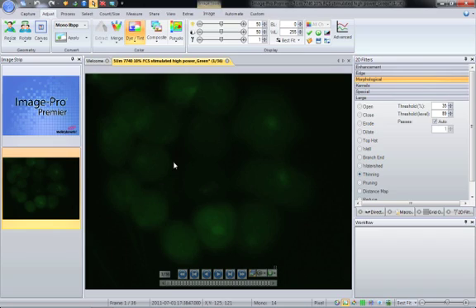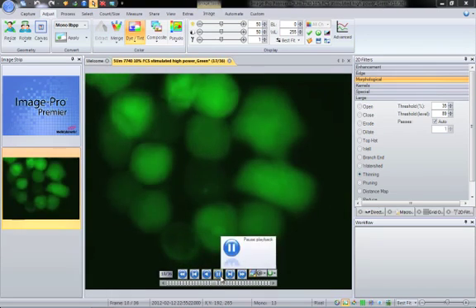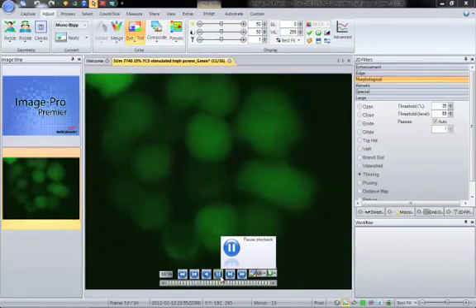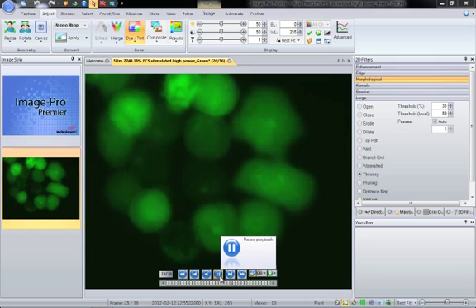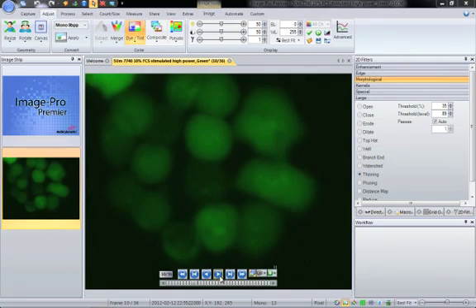So right here I have opened a sequence I have taken before, it is a calcium ratio experiment where I can see cells changing intensity depending on the ratio of calcium available. We can see the cells change density at a different rate, at different times.